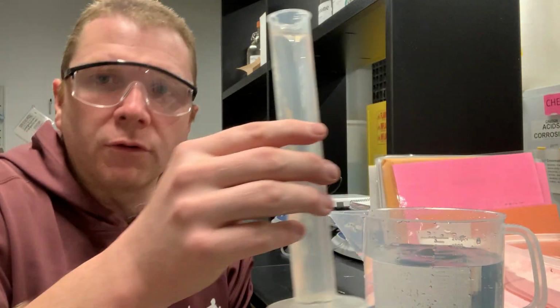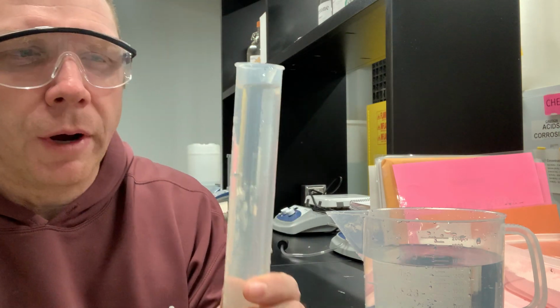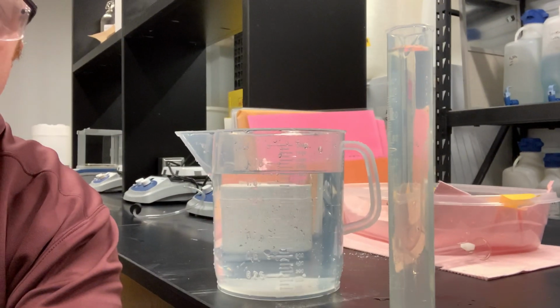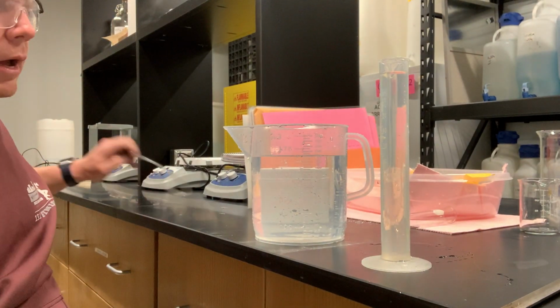Next up is my 100 milliliter graduated cylinder. Now, if you look at this, it's almost filled to the brim. The reason that this is filled up is because what I'm going to do is I'm going to invert this into my 2-liter pitcher.